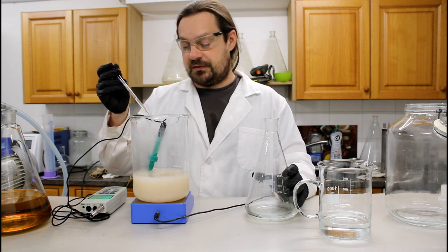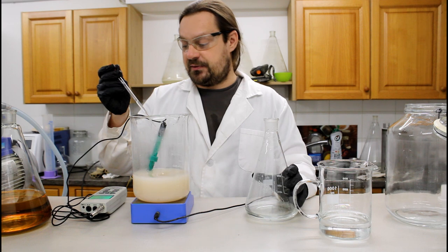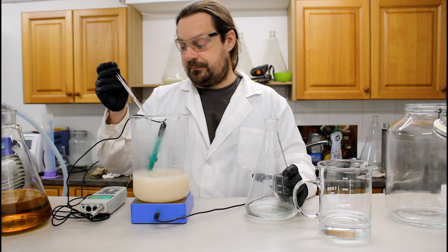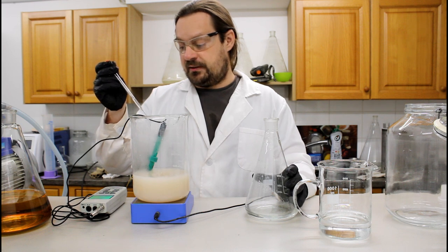So now I have to go slowly. We see that the precipitate has formed. So now I will slowly lower it to 8.5. 8.83, 8.82, 8.77.